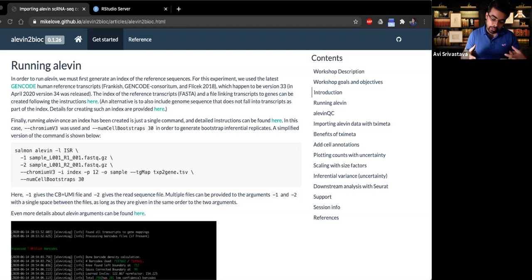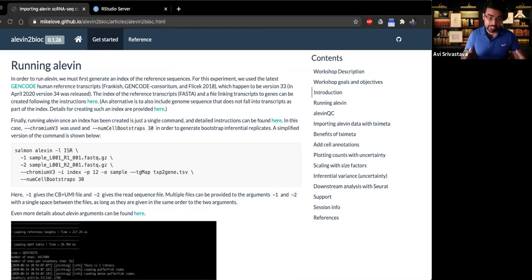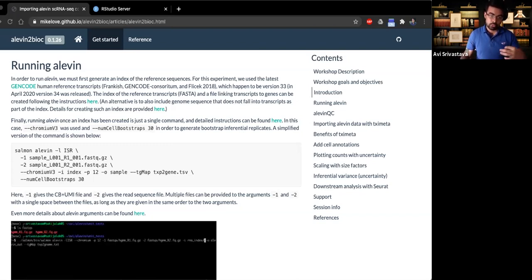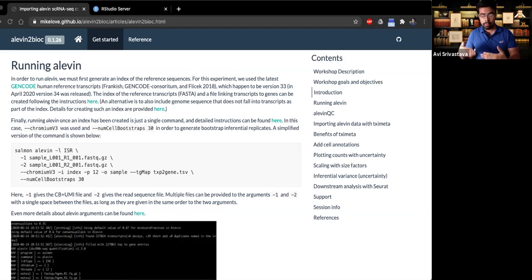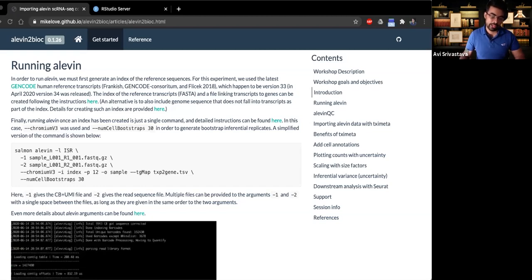People talk a lot about whether Alevin can be tweaked to make sure that a new, let's say, custom cellular barcode length can be provided. So yes, Alevin can be provided with custom cellular barcode and UMI length. You just have to provide --umi-length with the expected UMI length, and --barcode-length with the expected barcode length. And you do not have to give these meta flags. But basically what a meta flag does is set these barcode length and UMI length flags internally.